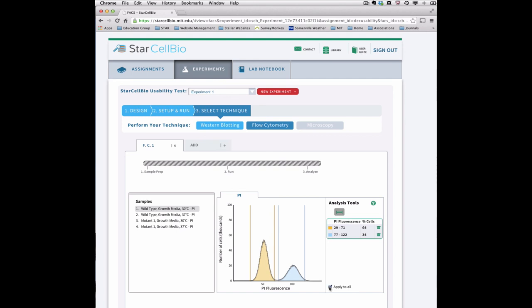Now you have completed a flow cytometry experimental technique within StarCellBio.